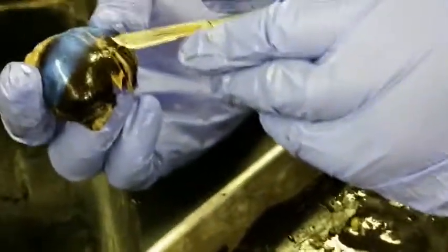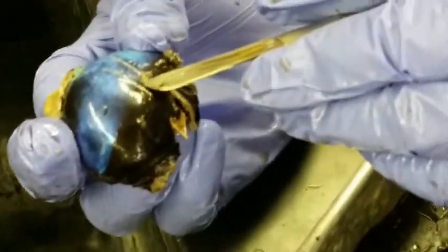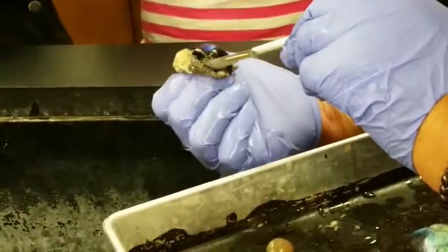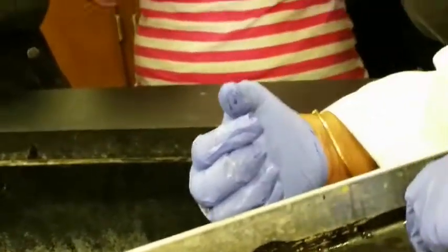So now this shows it very nicely. Testable. What is this right there now? That's the optic disc. So expect to see one pinned. That's the optic disc right there, whitish in color. Showed very nicely. So things to expect on the cow's eye itself: the optic disc, and also the ciliary body.